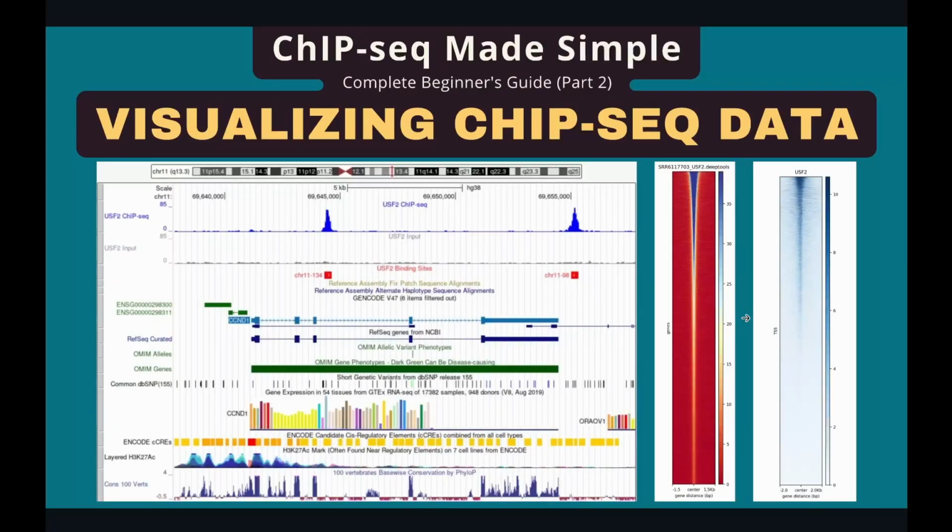In the last video, I showed you how to identify peaks in ChIP-seq data using Homer. In this video, I'm going to show you how to visualize these peaks. In ChIP-seq data, we often see beautiful graphs from a genome browser with feature-enriched tracks, or colorful heat maps. So what do they mean, and how do we make them?